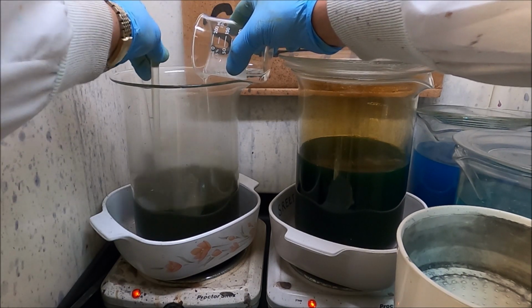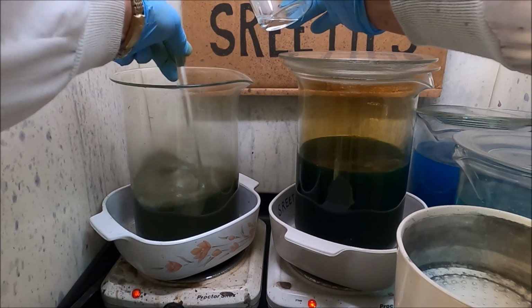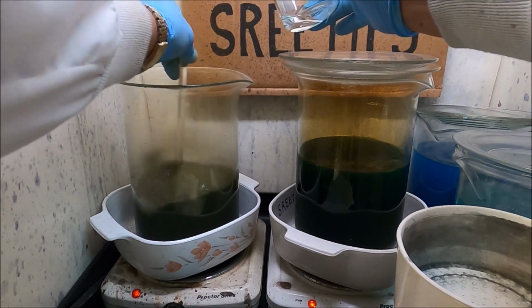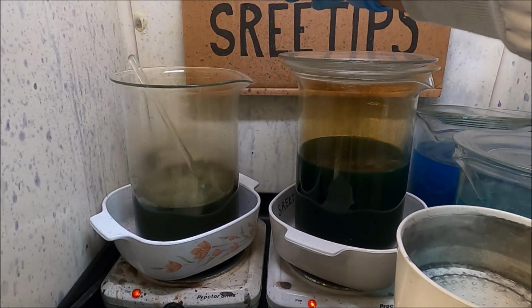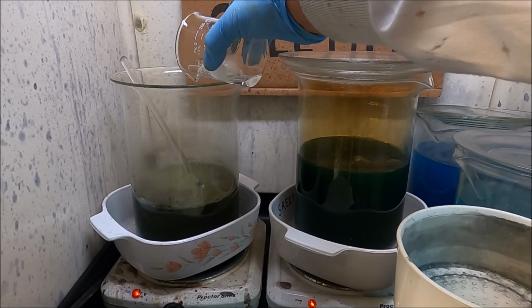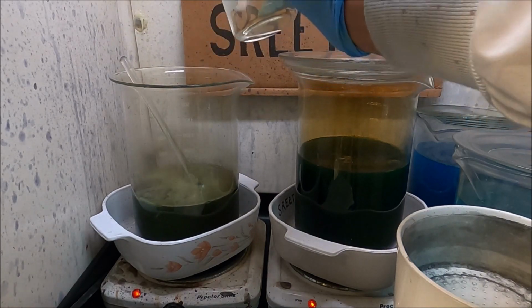If it doesn't take off real bad, then that'll kind of tell me, well, yeah, it kind of flares up there. So I still got some material going into solution there. So I got to be careful with my nitric additions. I don't want to overflow this beaker. Got about half of it in. I'm gonna pour the other half in now. Just trying to gauge where I'm at with how much soluble material is left in this beaker.